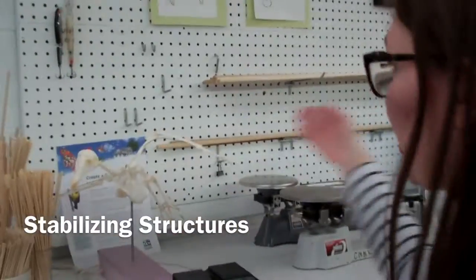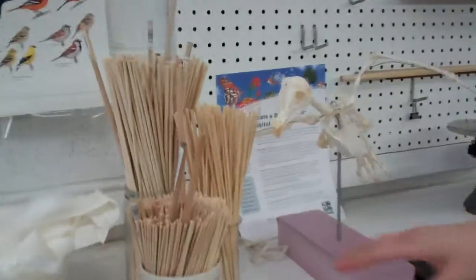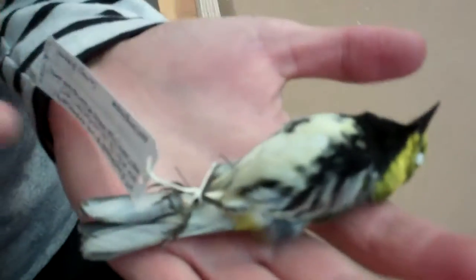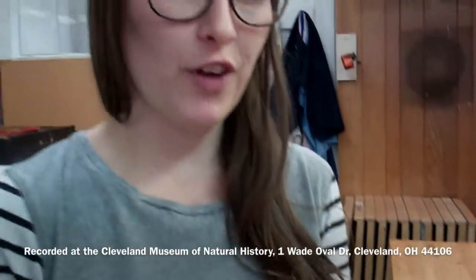Here is our little collection of dowels and small wooden sticks. Where they come into play in the specimen prep process is they get inserted into the bird prior to being stuffed with cotton. This acts as a stabilizing agent — you can see I've cut the stick back as far as I could once the bird is dry. These are very fragile little specimens; it's just their dried skin and cotton inside, so they're very delicate. The stick acts as a stabilizer to keep the head on nice and snug.